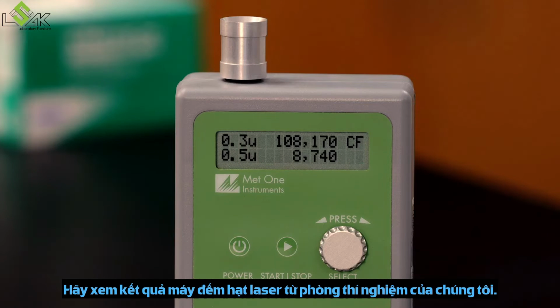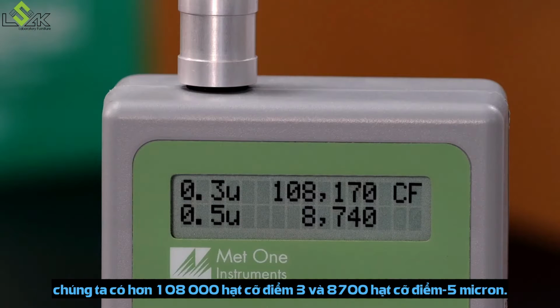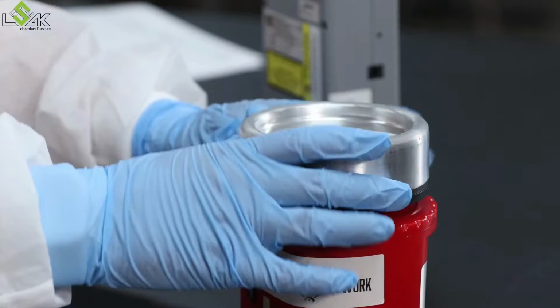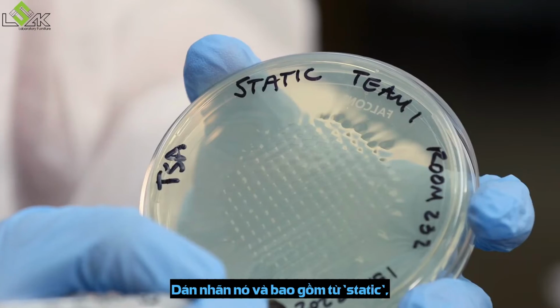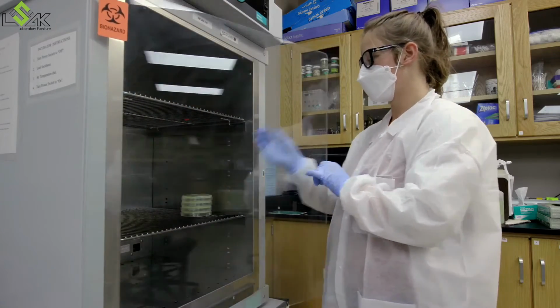Let's look at the laser particle counter results from our lab. For every cubic foot of air, we have over 108,000 0.3 micron sized particles and 8,700 0.5 micron sized particles. Record these results in your lab notebook. Remove the plate from the active air sampler, label it, and include the word static. Incubate it upside down with the others.